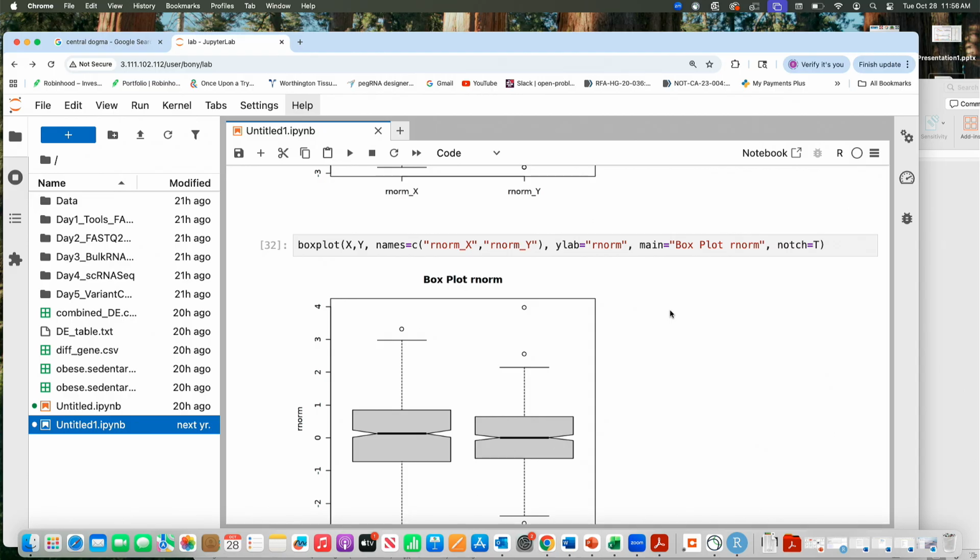For the boxes, in the first figure you can't see a lot of difference, but when you do a notch, you feel that the second one is slightly lower. But it needs to be a little more lower than that to make sense. The idea is that using a notch function sometimes will allow you to look at the data and say, okay, this seems statistically significant. But statistical significance always needs to be tested, and you need to generate a p-value and report the p-value for the statistical test. The notch will give you a visual sense of that, and then you put a p-value over top of it, it will make it more palatable.